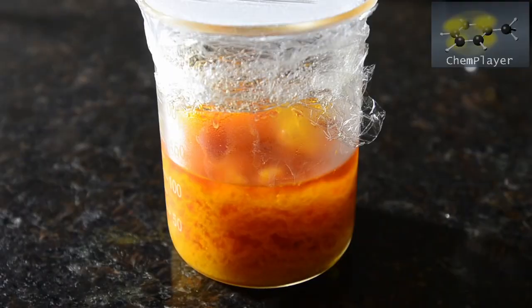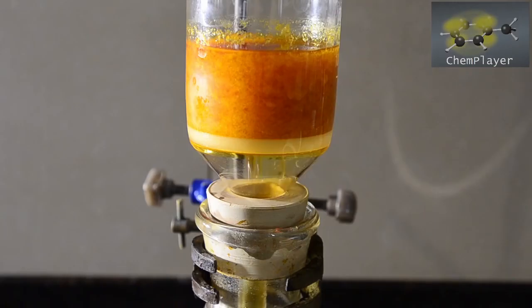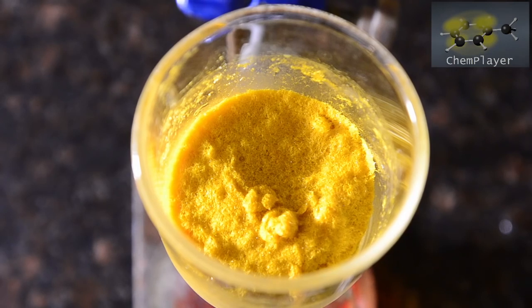Here's the result an hour later. A mass of yellow crystals in the liquid. Very pretty indeed. We set up for filtration once again, and filtered the crystals. We left them on the pump drying for about 30 minutes to make sure that they were completely dry.